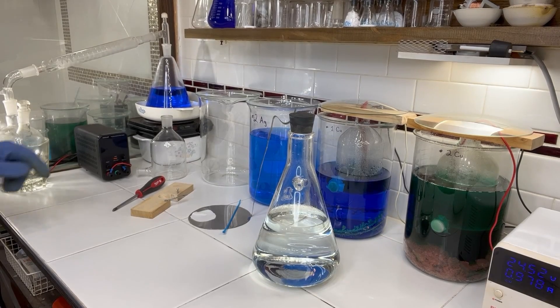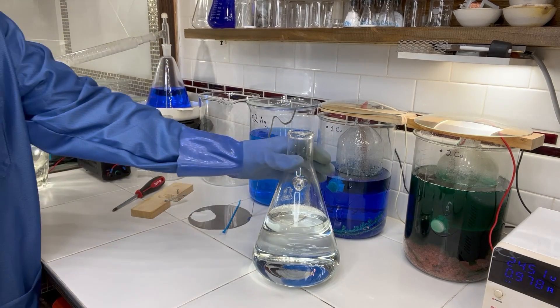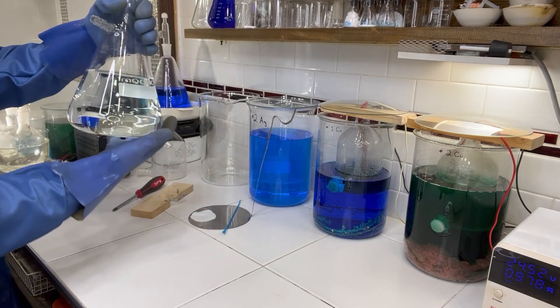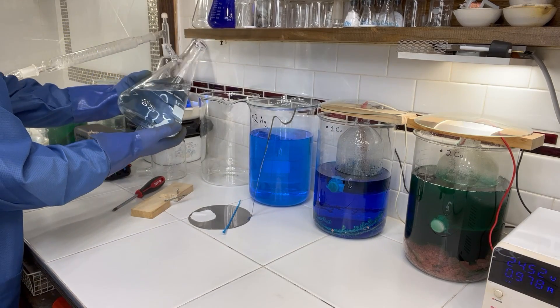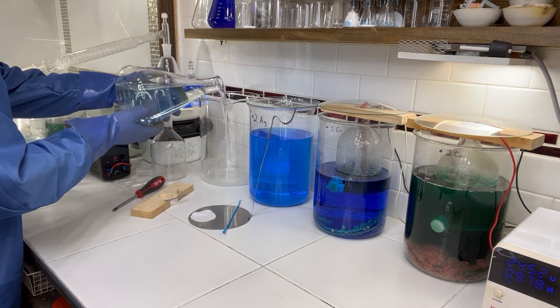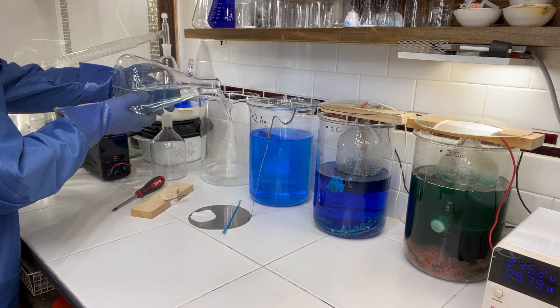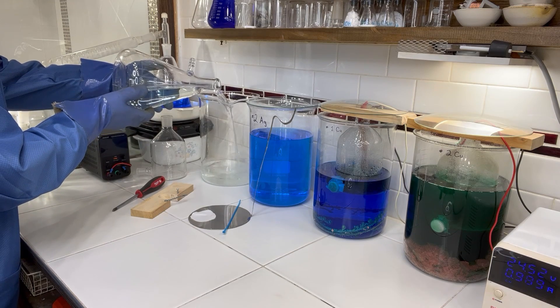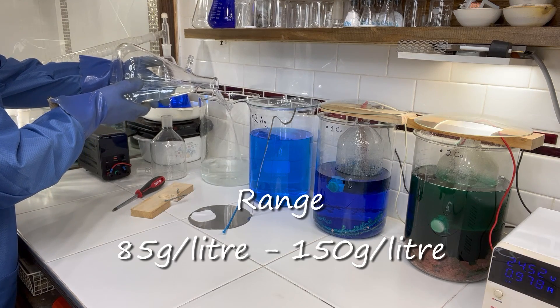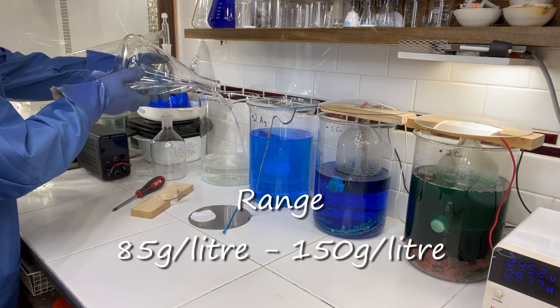Okay, it's finally time to put the cell together. First thing I'll do is get our electrolyte inside the beaker. We have 400 grams of silver in solution and I like to run about 100 grams per liter, so I'll titrate this up to four liters using distilled water.